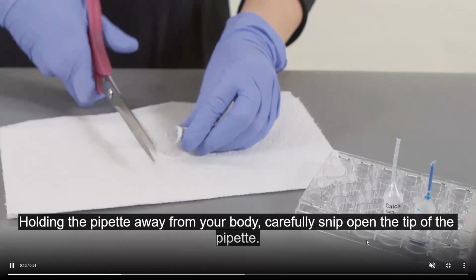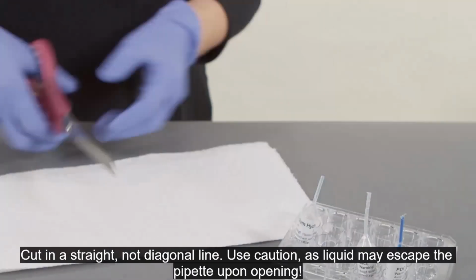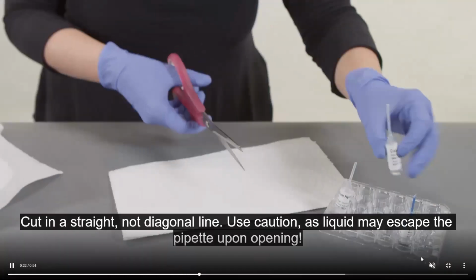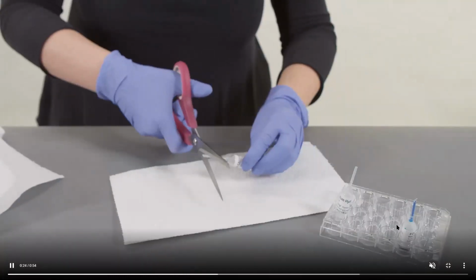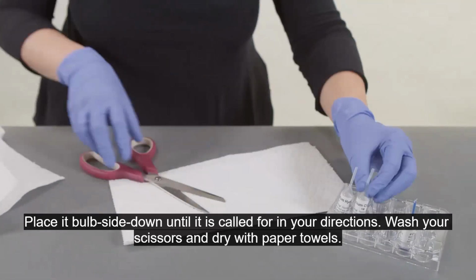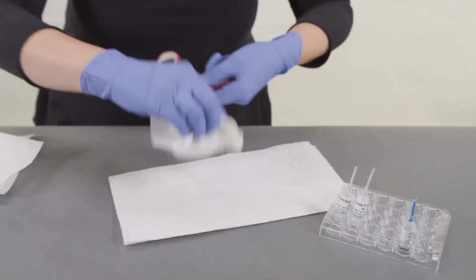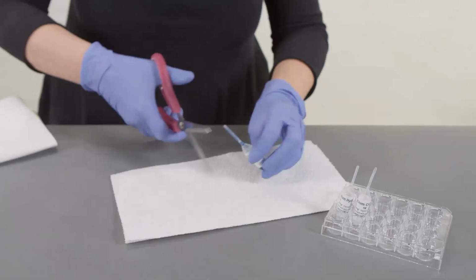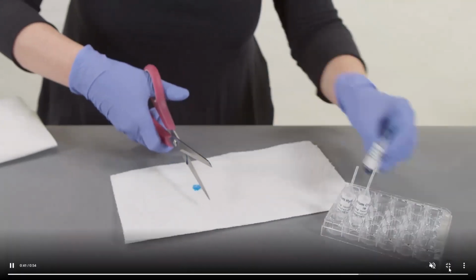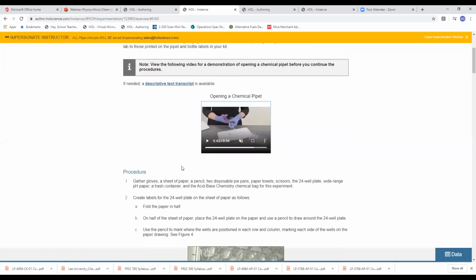So you'll notice they're in dropper pipettes that are hermetically sealed. The student is expected to open those with a pair of scissors. They are stored upside down in a well plate so they don't drip while the student is conducting the procedures. And then again, the volumes within those sealed pipettes is never more than 3 milliliters. So very small scale, very safe. And we'll go ahead and pause that video.